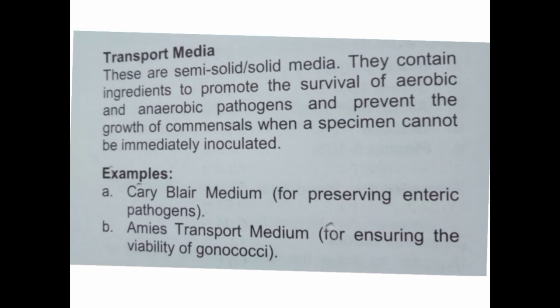One main point is that solid media will be prepared in a culture plate, while liquid media will be prepared in a tube, in a test tube or in a conical tube.